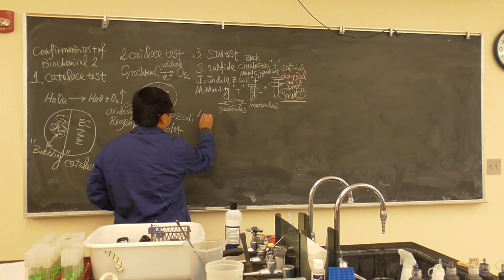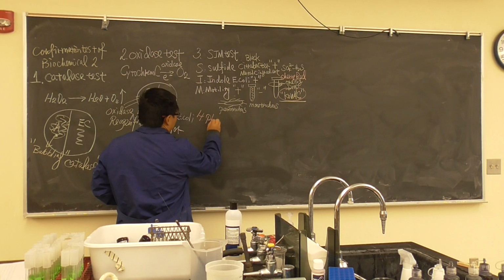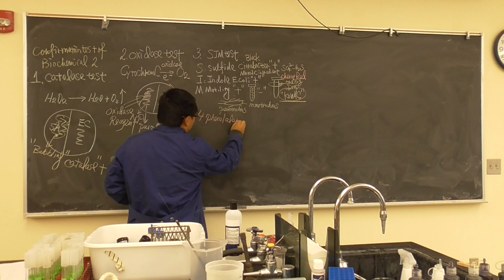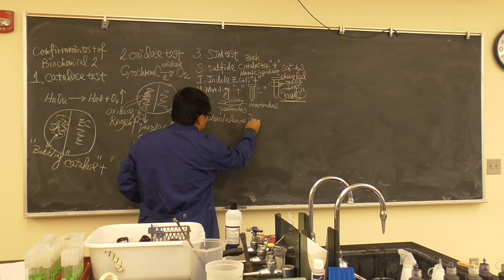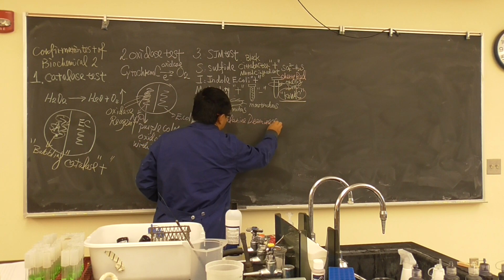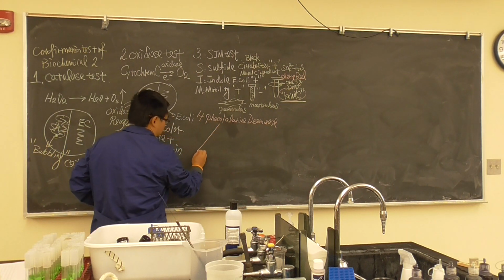You can do the test by yourself. Number 4. Phenylalanine deaminase test. What we should add? You remember?